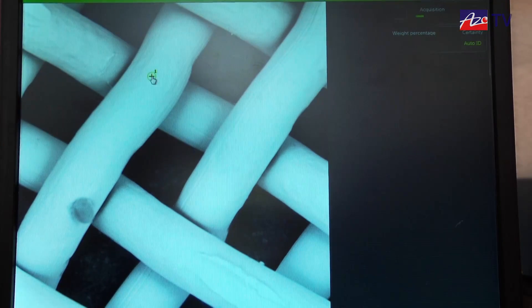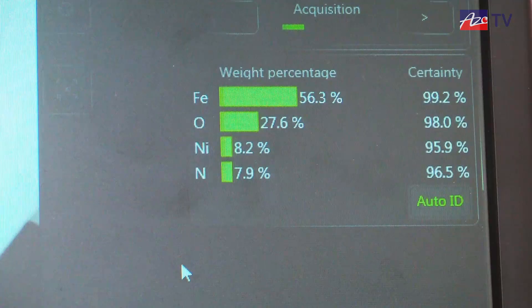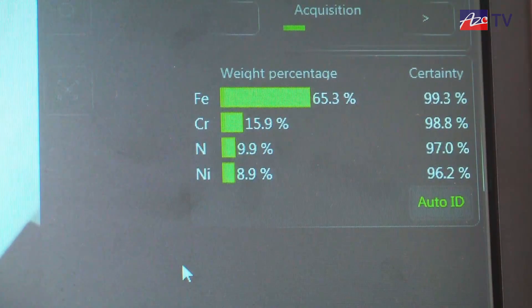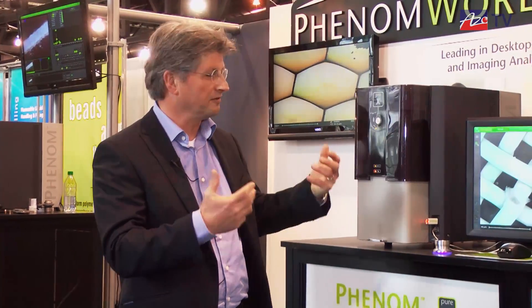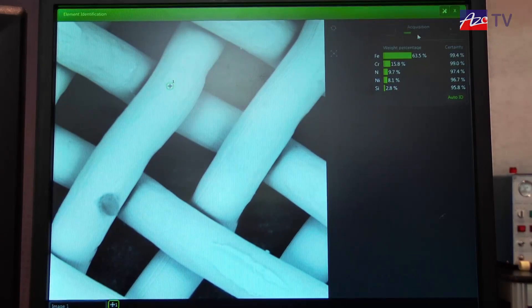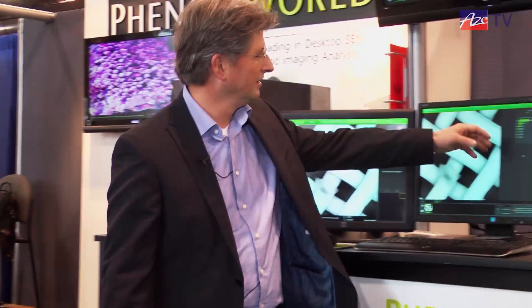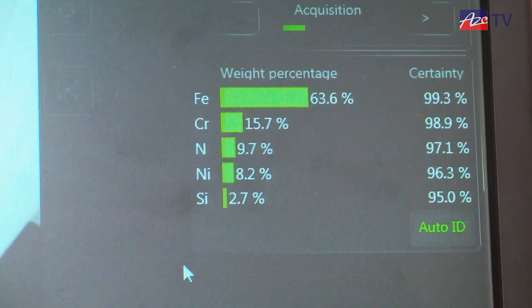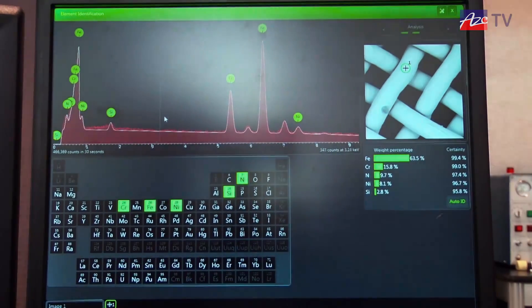We are selecting one point or maybe two points, and now the system is starting to collect x-ray information generated by the electron beam. It will show which chemical elements the specimen is made of. This is an example specimen — not very exciting, but it keeps it simple. Selecting one of these two points, you can see already which elements are present. For most customers, this would be sufficient information.